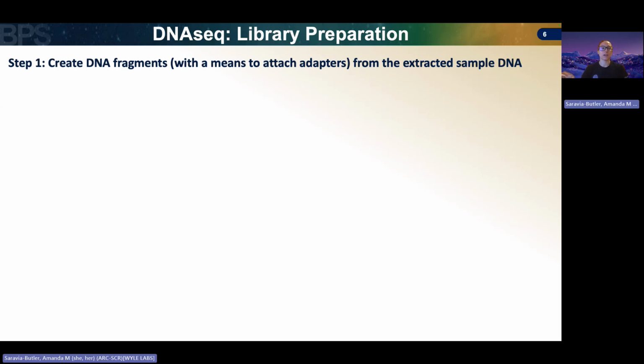And so here, this is going to start first. You're going to isolate DNA from your samples of interest. There's a variety of different ways you can perform DNA isolation. There's different types of kits. You can also use different types of chemicals and chemical washings to isolate your DNA.